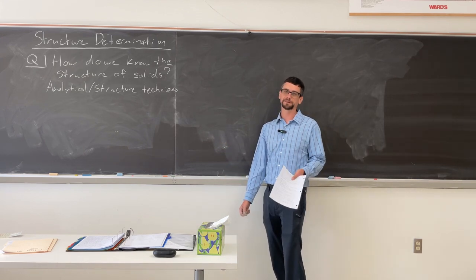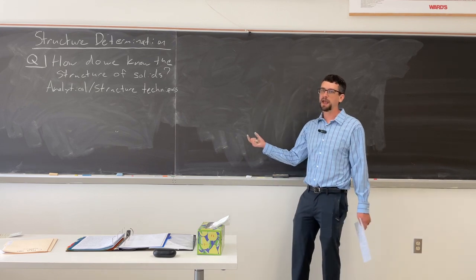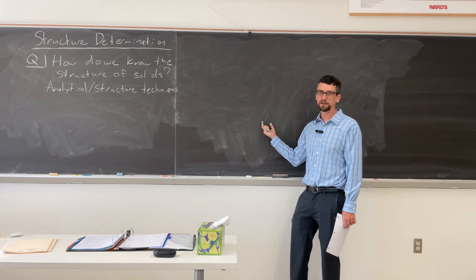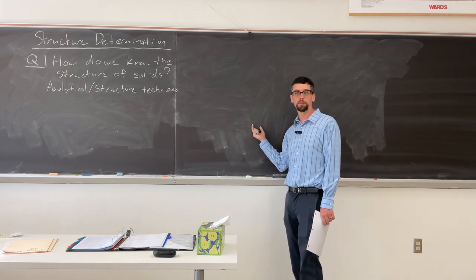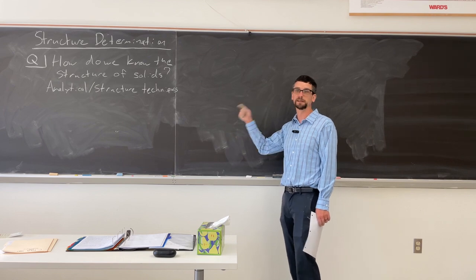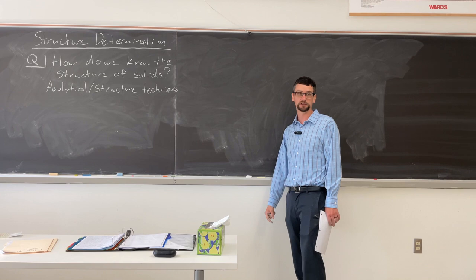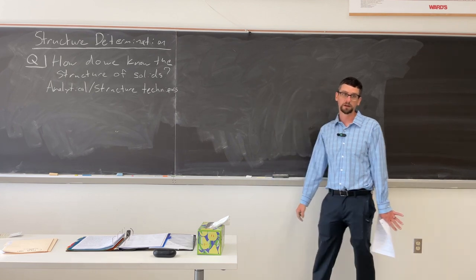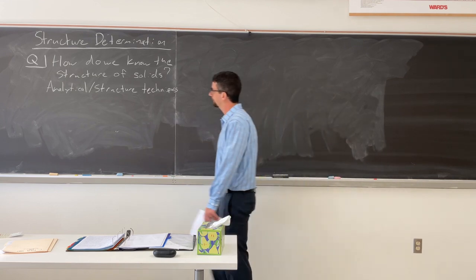And you can pair them up with one another. Like you guys said lasers, and I said, sometimes. At UB, they have a single crystal X-ray diffractometer paired up with a laser pulse system so they can study excited states. What they want to try to do is isolate a transition state for the first time ever, so they can watch chemistry happen. It's pretty neat.